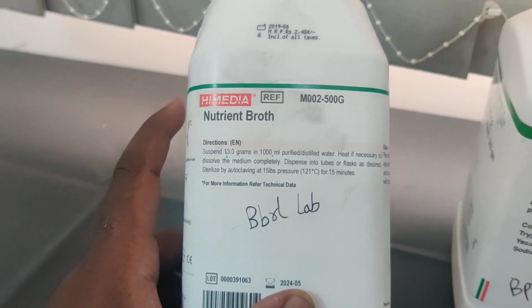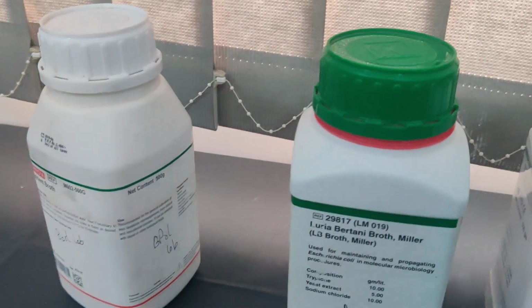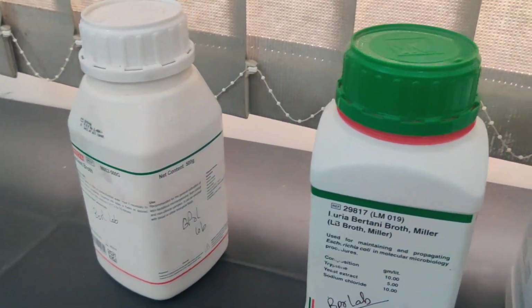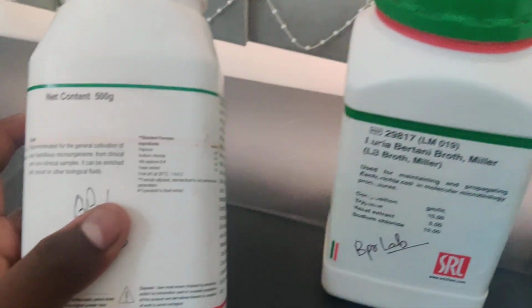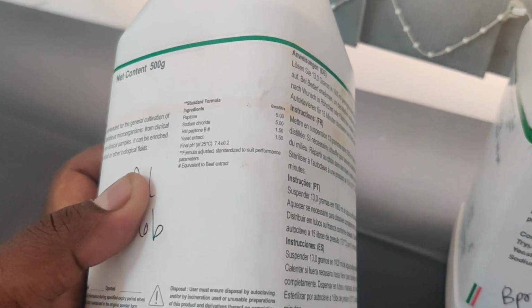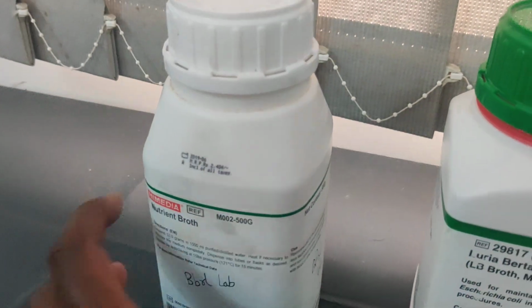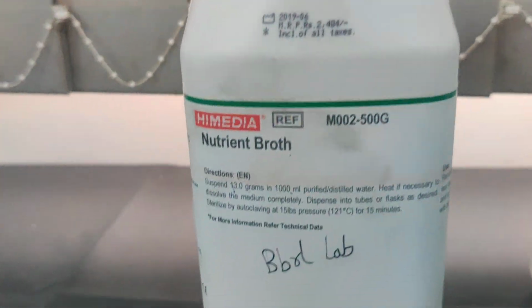So for nutrient broth this is the composition. You have to take 13 grams of this powder, that is enough. But if you are going to prepare it individually, then you have to prepare according to this composition: peptone 5 grams, sodium chloride 5 grams, HM peptone 1.5 grams, and yeast extract 1.5 grams. You take these and then add water. So we don't need to take them separately, because we have a nutrient broth.